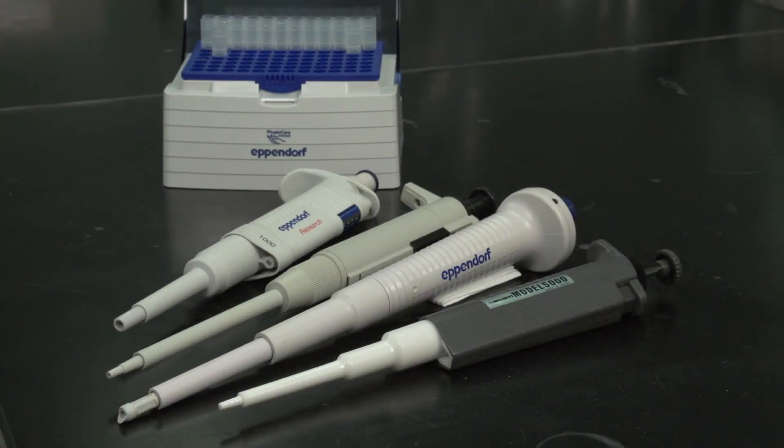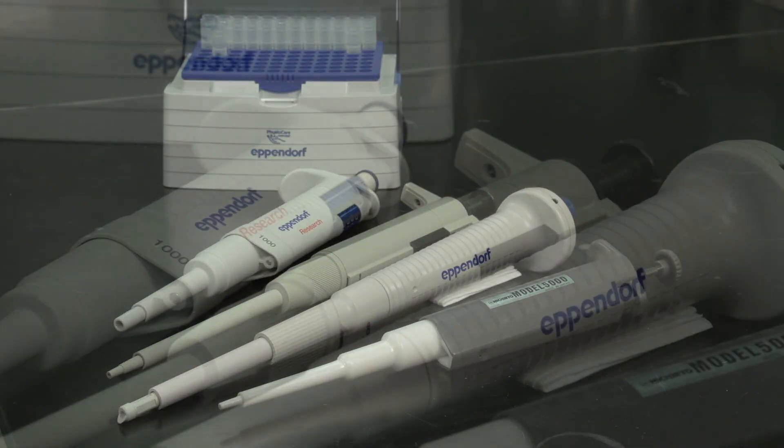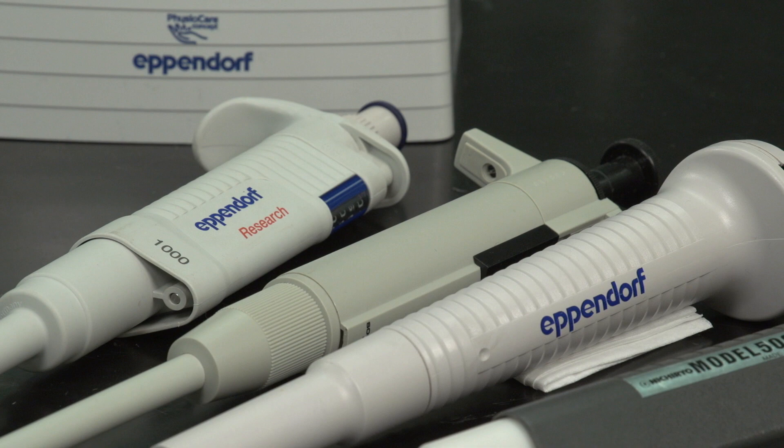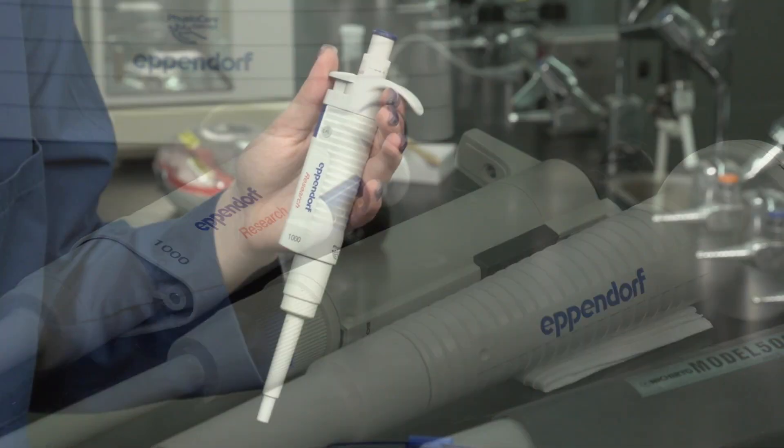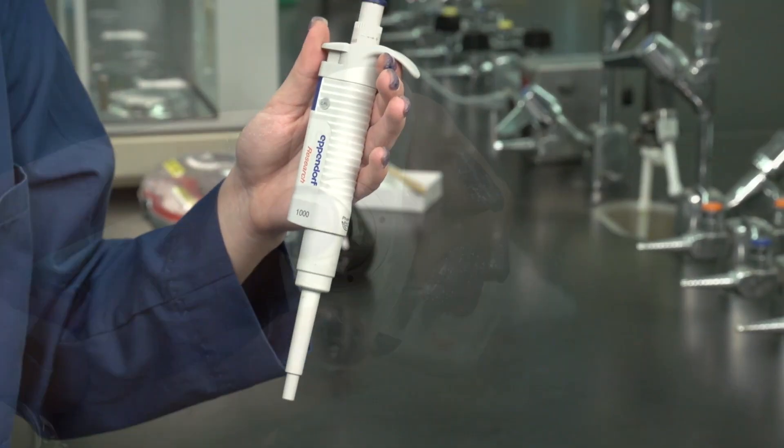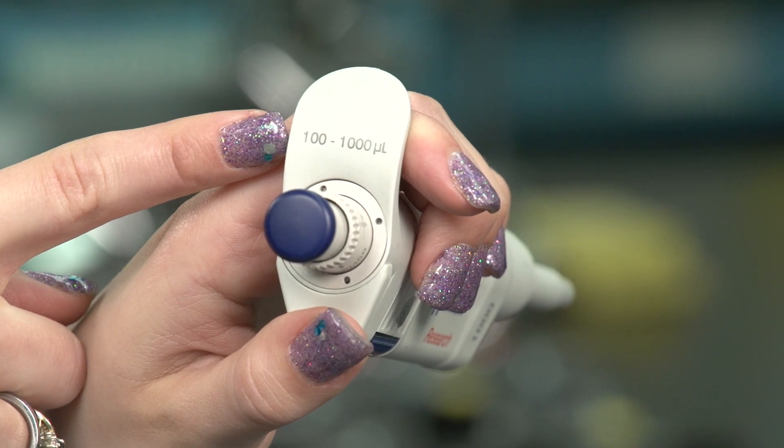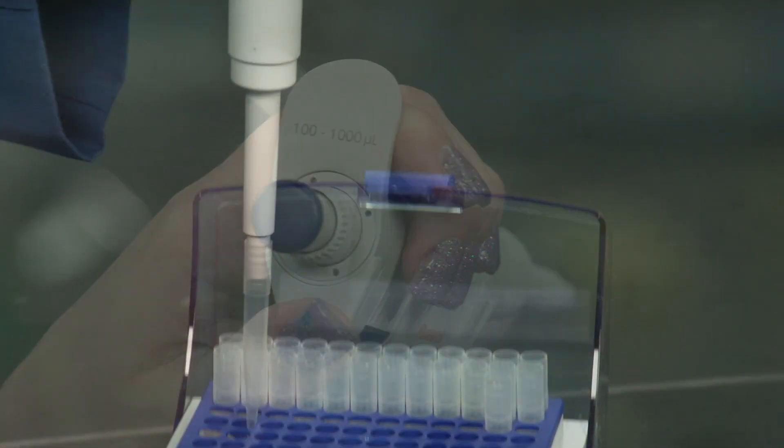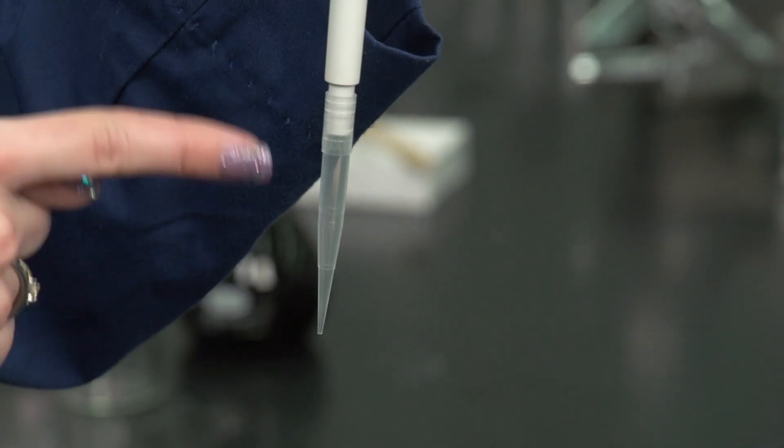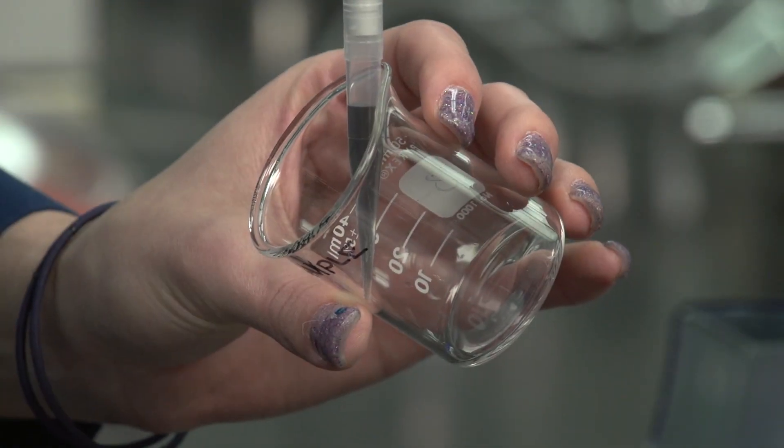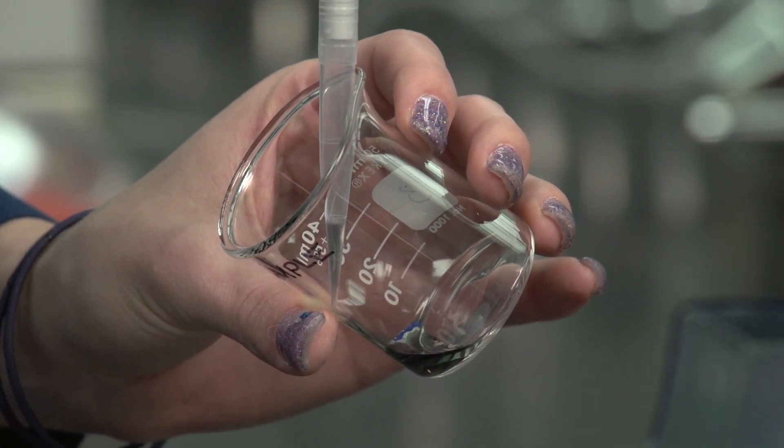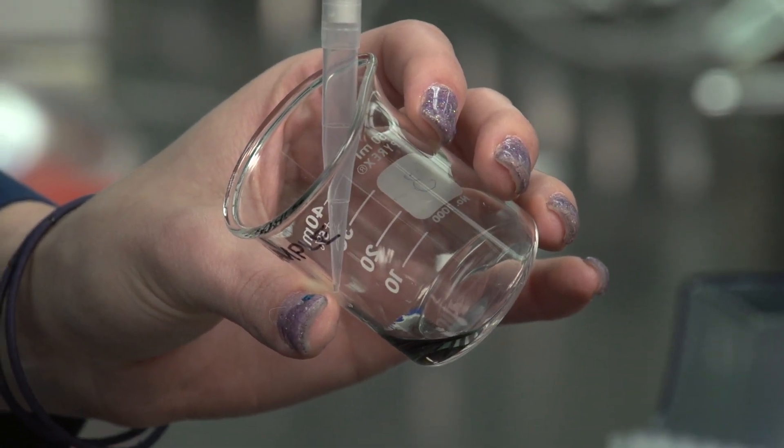The micro or adjustable pipette is a general-purpose handheld instrument used to dispense variable volumes of liquids. The system consists of an adjustable volume pipette and a specially designed precision-molded, non-wettable disposable plastic tip. Use of disposable tips eliminates pipette cleaning and reduces the danger of contamination.